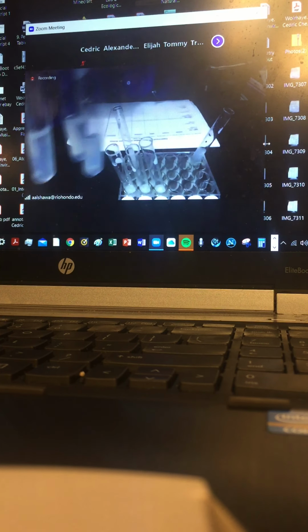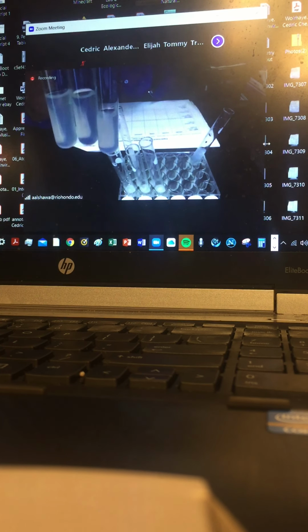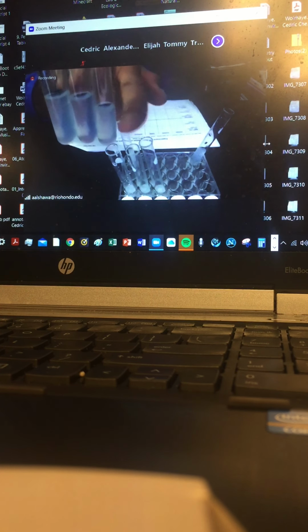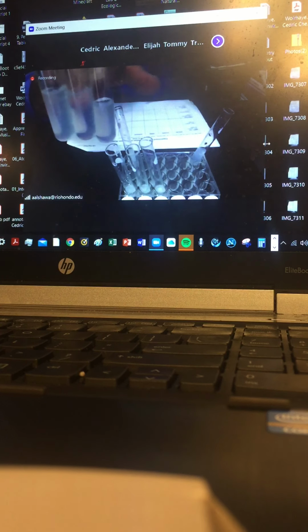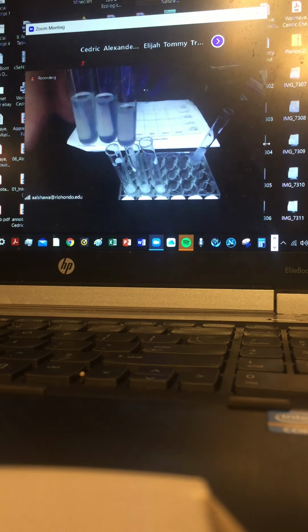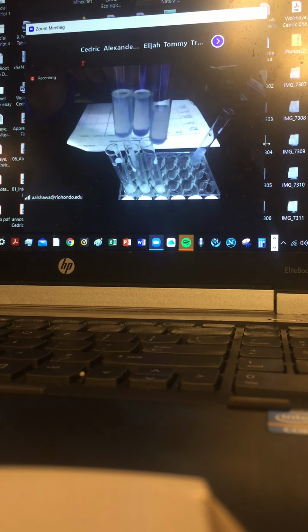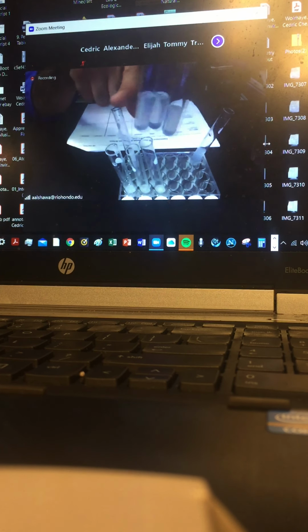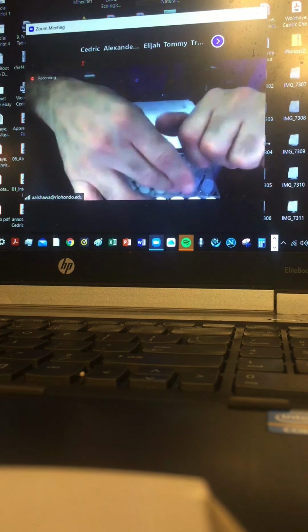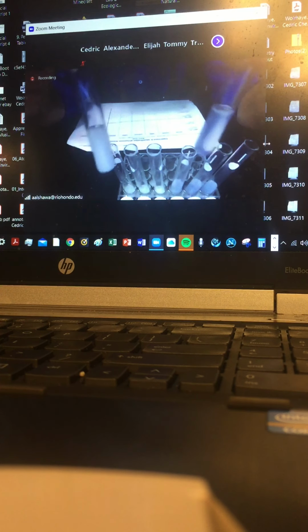So this is the outcome of these. They kind of resemble each other as far as the outcome. Can't tell them apart. Okay, so the first test tube is the carbonate, the middle one is sulfate, the last one is phosphate. So upon the addition of the nitric acid, now they resemble each other. That's the final step. But the step before it, they differ. So just remember exactly their colors on the first step of the addition of the silver nitrate. Okay, and these are the unknown 1 and unknown 2.